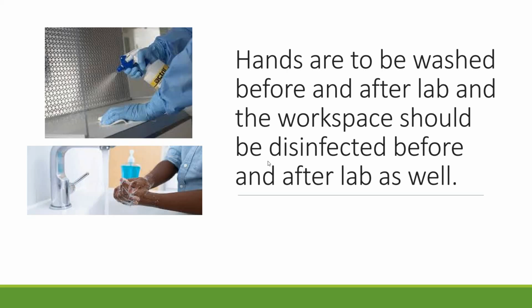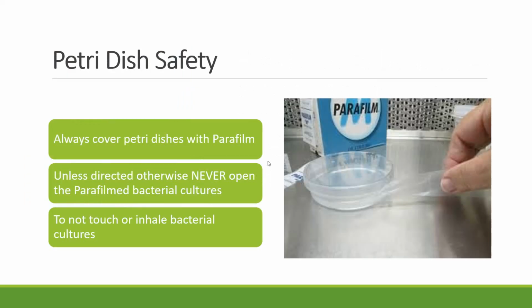Again, walking into a patient's room, walking into a lab, whatever it is, the first thing you should do is know what you're supposed to be doing in that setting. Wash your hands to ensure you're not bringing in contaminants, and glove up to ensure that you're not going to spread any. And then, of course, you will properly dispose of it.